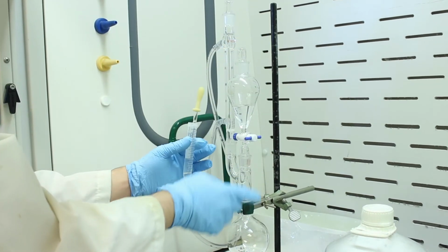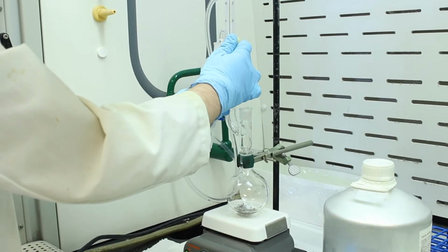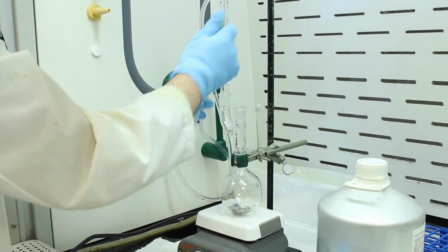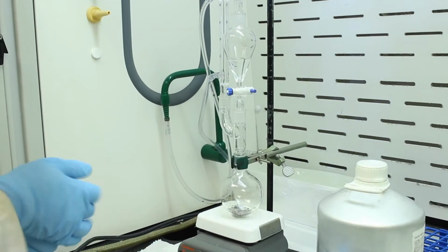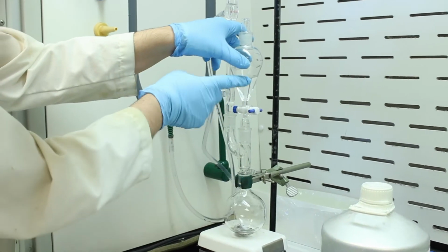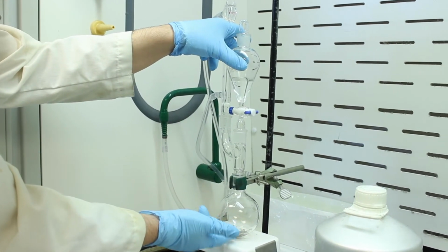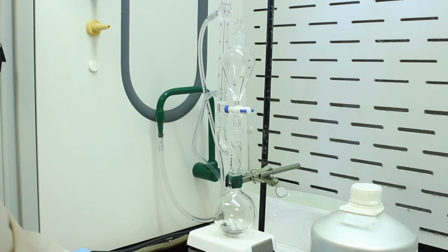Okay, and the remainder I will add directly to the solvent here. Okay, so we have our bromobenzene and ether solution in the sep funnel, and then we have bromobenzene and ether in the magnesium. And with any luck, they should start reacting.